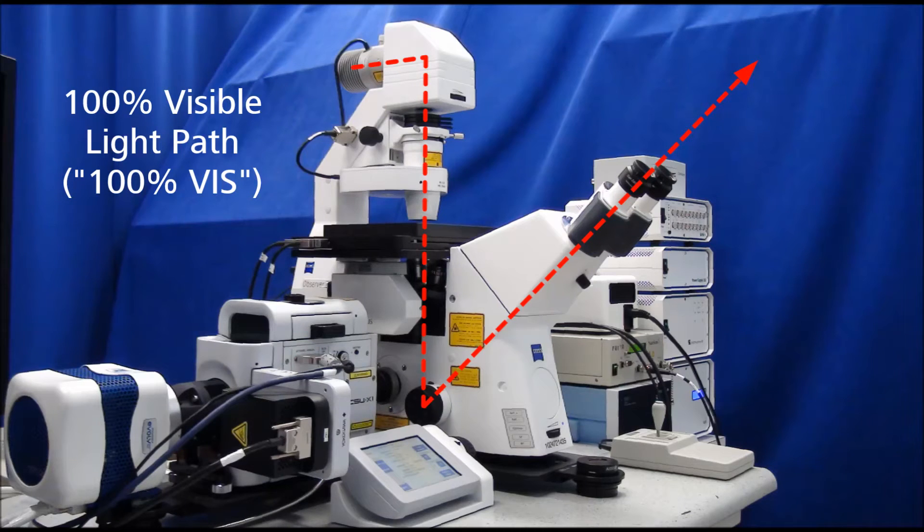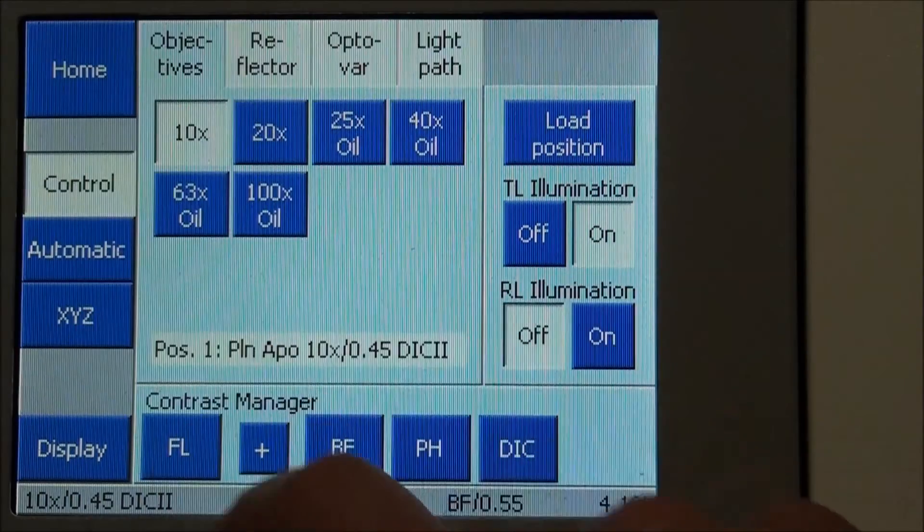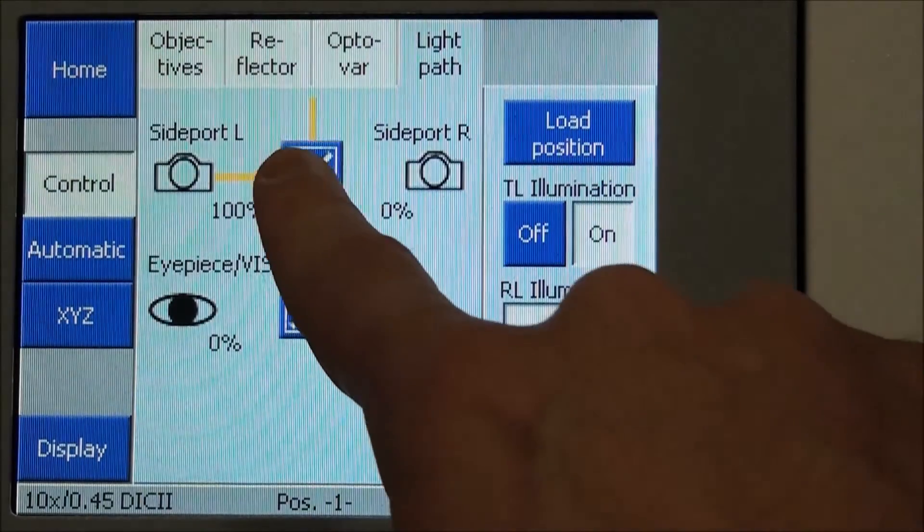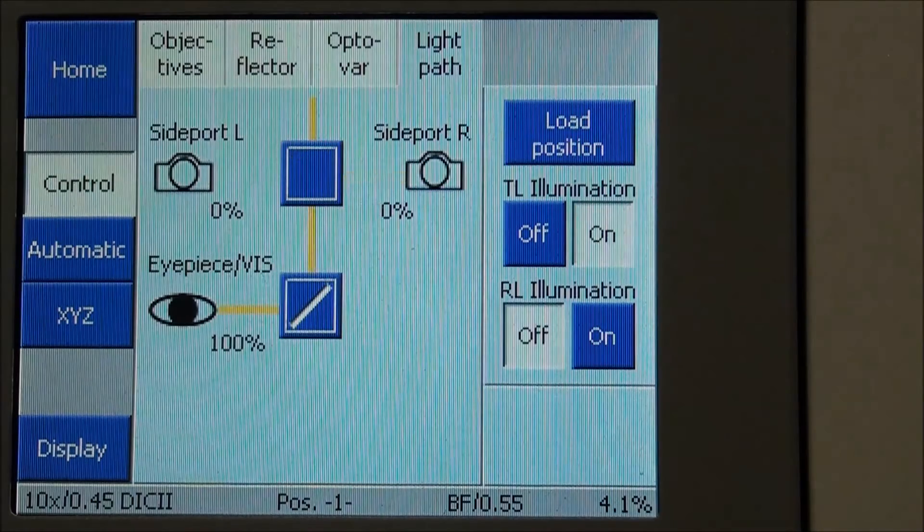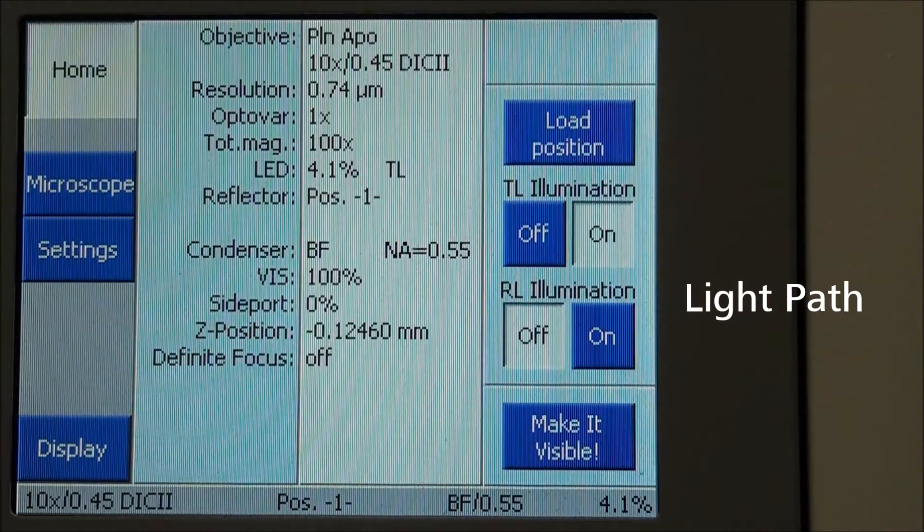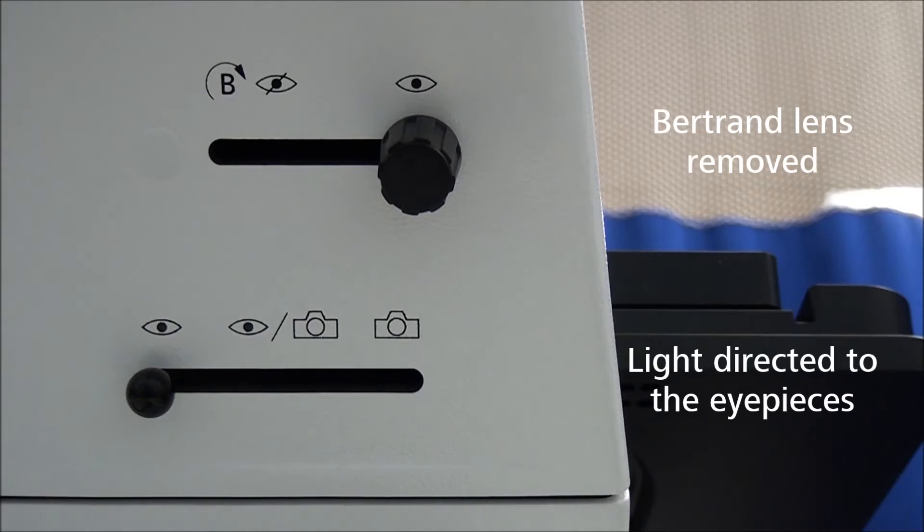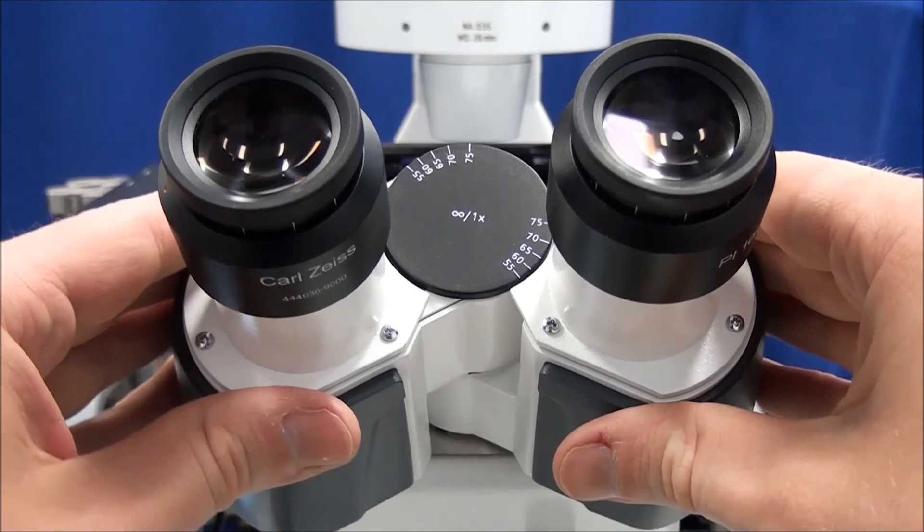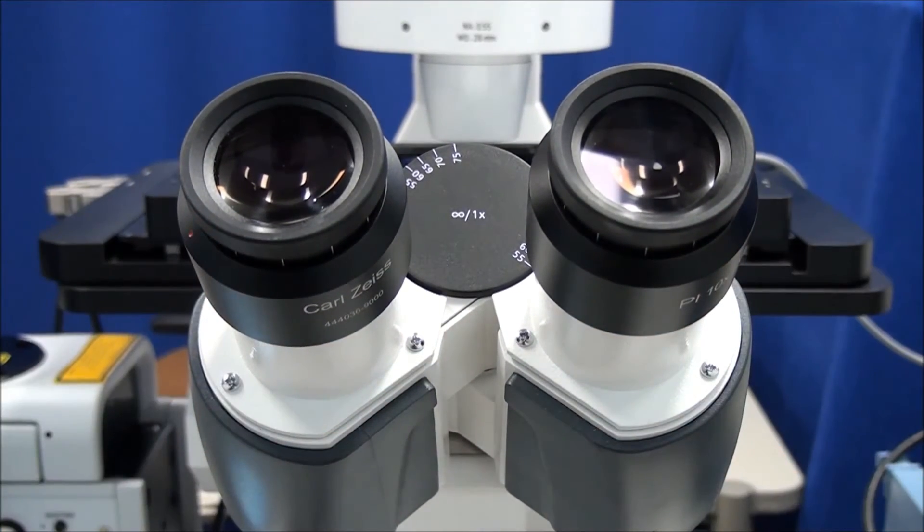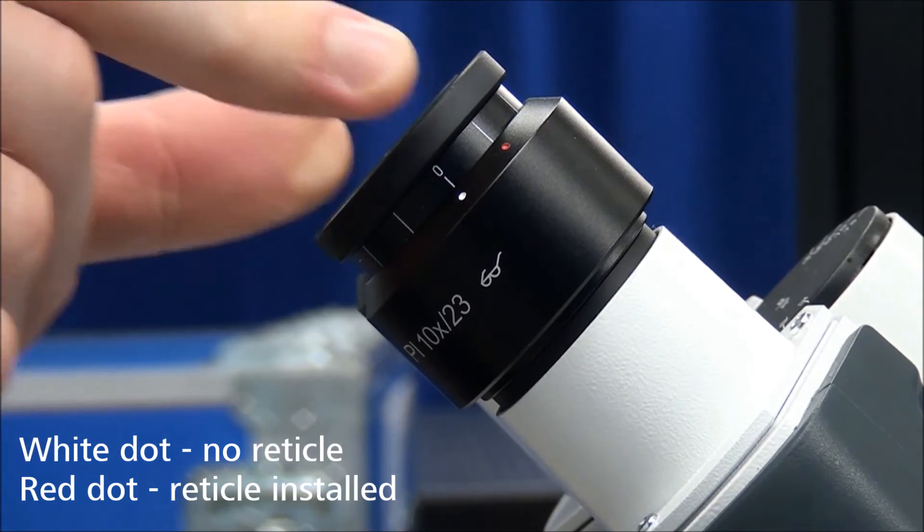Direct the optical path to the eyepieces. Either manually rotate the light path selector, or change the path via the touch screen to 100% vis, as seen on the home screen. On the binocular tube, move the selector to the eyes symbol and remove the Bertrand lens, if equipped. Set the correct interpupillary distance for your eyes and adjust the diopter setting appropriately. Use the red dot if a reticle is installed.